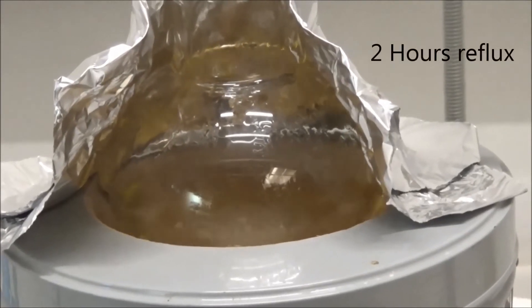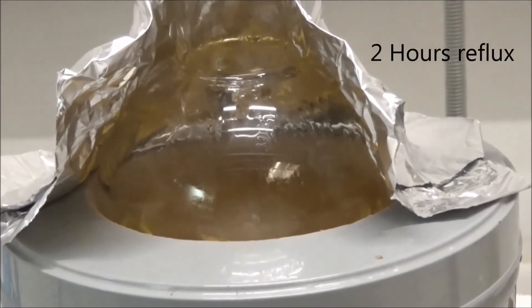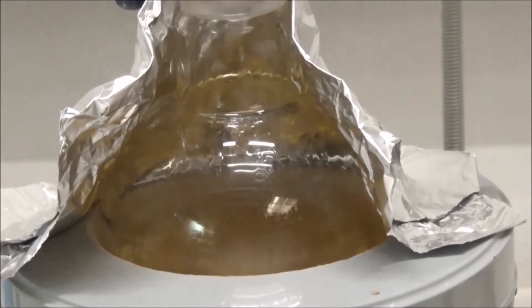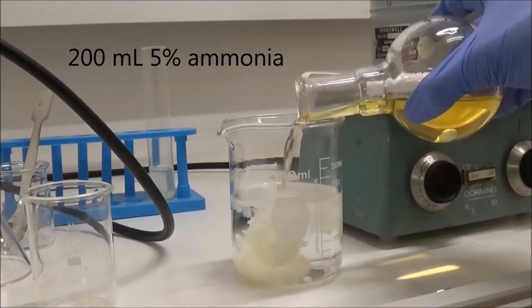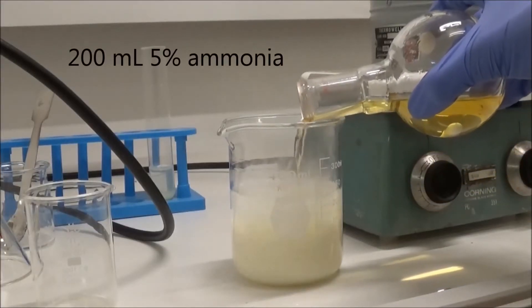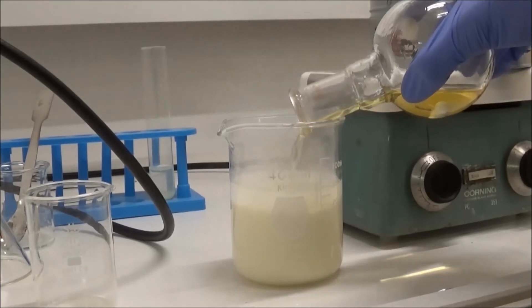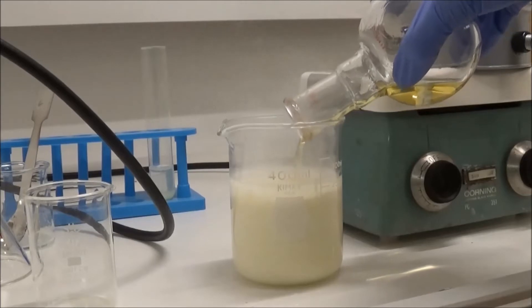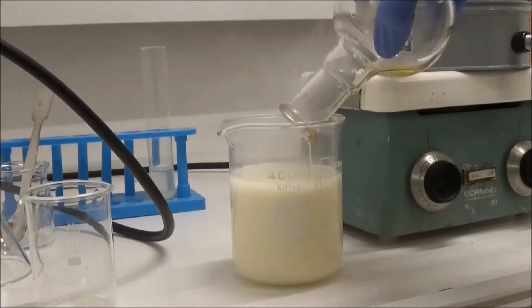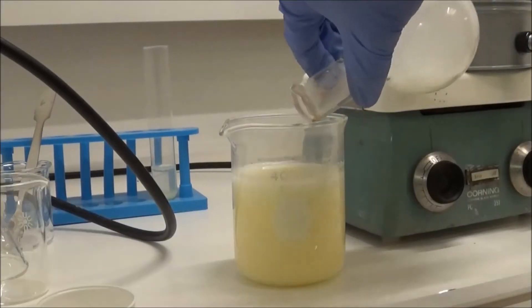The mixture was boiled for a total of 2 hours. After finishing reflux, it was cooled to room temperature and poured into 200 milliliters of 5% ammonia solution. The flask was rinsed out with more.